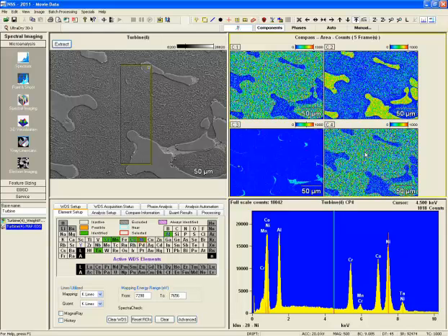It actually seems to be in that speckled region, so maybe the EDS is trying to pick out those individual particles that tend to be submicron. The EDS really probably doesn't have enough spatial resolution to do that, but it is trying its darndest to separate those out. But those are very, very similar.